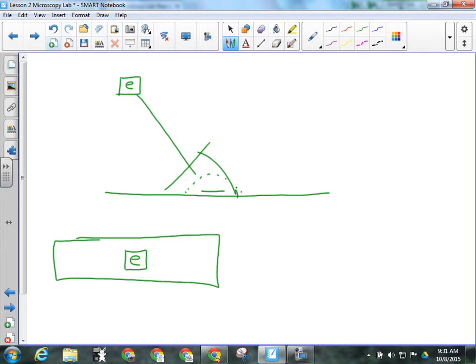Why do we bother putting a cover slip on? No stuff gets in the water. That's part of it. It doesn't fall off. If you're looking at a letter E, or a little tiny clipping of newspaper, if you were to sneeze or breathe heavy, it would fly away. It'll stick and it won't move around, so whatever you're looking at is stuck in one place. But the biggest reason is if I've got a wet mount, I've got water on a slide. I don't want my lenses getting into the goop. If I was looking at a blood sample, I wouldn't want my lens touching the blood. How would I clean that off of the lens after? So the cover slip is there to protect the microscope itself.